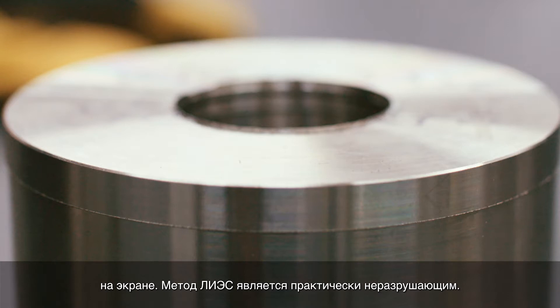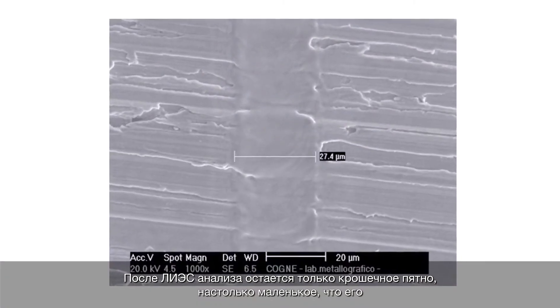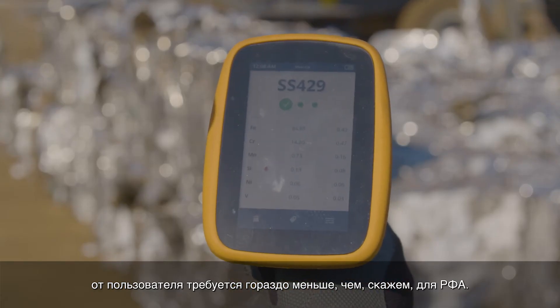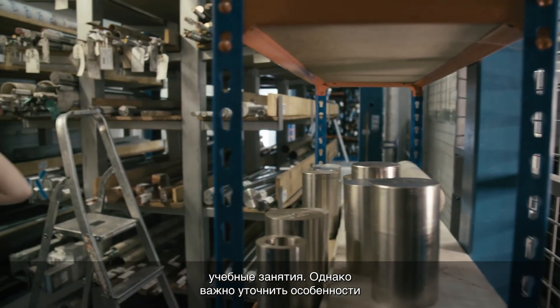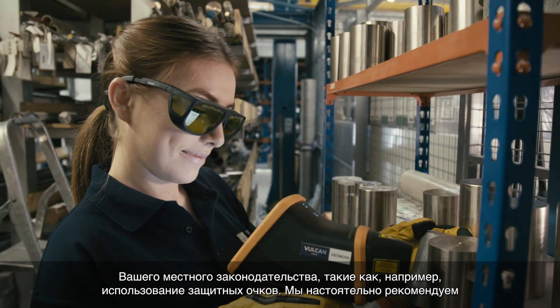The LIBS technique is virtually non-destructive. Following a LIBS analysis, the tiny burn spot left is so small it can be difficult to see with the bare eye. From a regulatory and licensing point of view, much less is required from the user than, say, for XRF. Typically, no expensive licenses or time-consuming training classes are needed. However, it is important to check your local legislation, such as the use of safety goggles. We strongly recommend using safety goggles when operating a class 3B laser device.